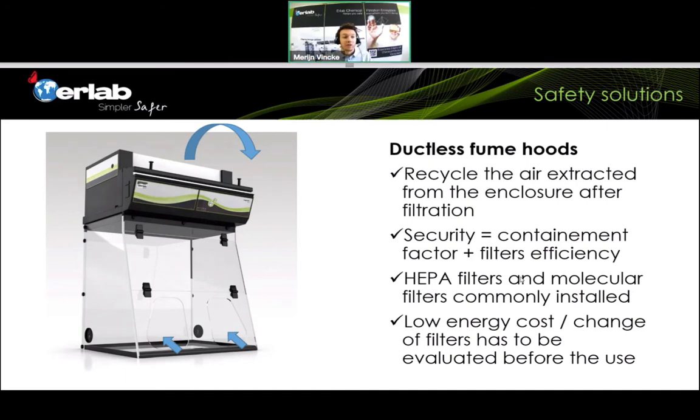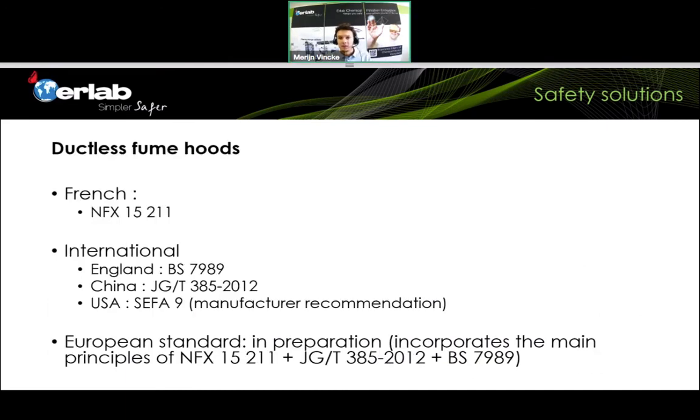Just to give you an idea about the different standards, again, that these ductless fume hoods are exposed to or that they use. Of course, there is one standard that is the most stringent one, which is the French standard. It's the AFNOR NFX 15211. And then there are a few international standards as well, which is one for England, for China, and for the US. There are some people from the US who are as well connected. This may be one of the rules or the international standards that you may know.